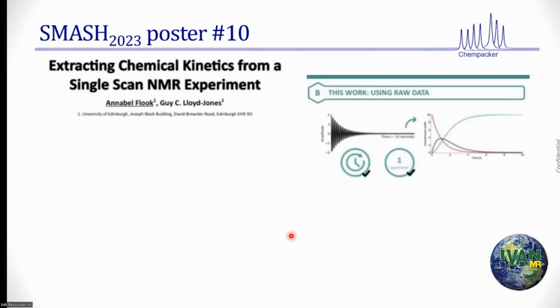And this was triggered by a poster. They wanted to study what happens when there's a reaction happening during your acquisition. Now you can do that, definitely. Think of laser-induced reactions that happen within a second. You can follow that, sure. It doesn't have to be a singlet. It can be any multiplet you want. Overlapped multiplet, sure. All you need to do is first convert that into a table and then work with the table.